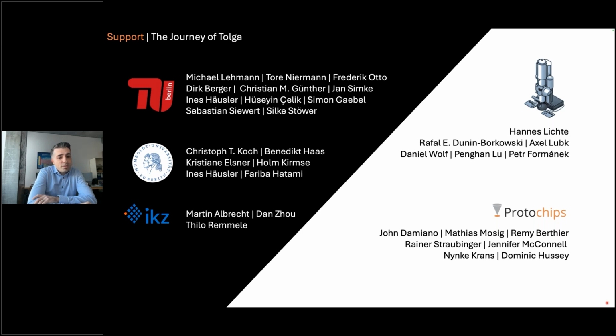Outside of Berlin, I got a lot of support from people who are also interested in biasing and electron holography, which is a lot. And last but not least, I'm very grateful for the support I got from the Protochips guys, because they were a great help when it came to modifying some of their equipment, which is, I guess, not the normal case for TEM investigations, but in my case it was necessary. They also helped with new chips and new chip designs, which was a big help for my research so far. So let's start.